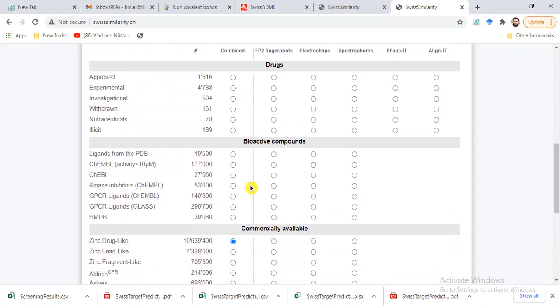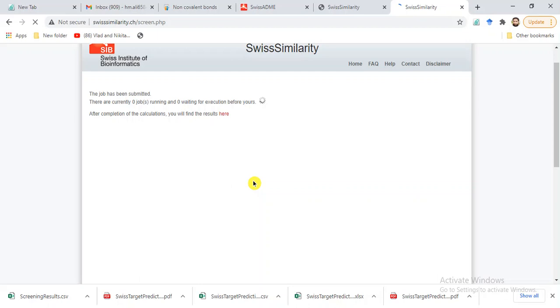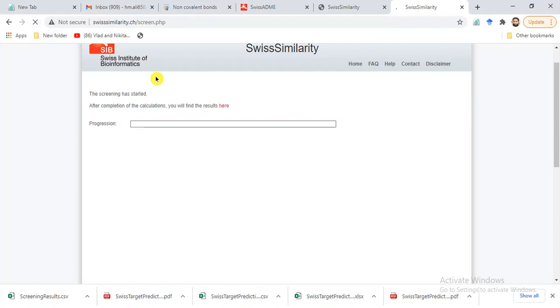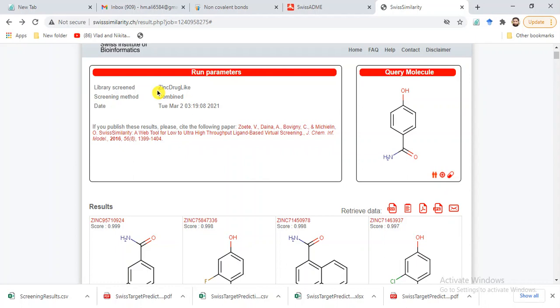After choosing one option, we submit our file and after some time it will perform library screening. I have already run a virtual screening beforehand since it takes some time. The result is a library screened from the ZINC drug-like library, using the combined screening method, with the date and time shown.